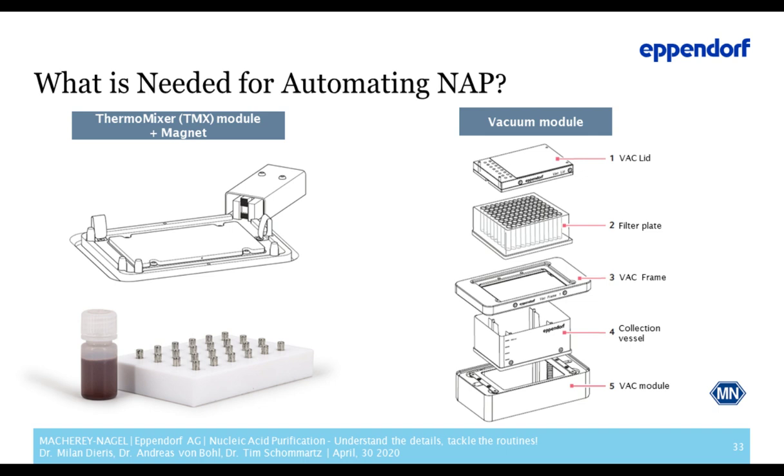What you need in addition, and that has been depicted on top, is some sort of mixing module, because in between the purification steps, you want to mix your DNA and bead solution in order to get a homogeneous solution to get the best possible extraction results.